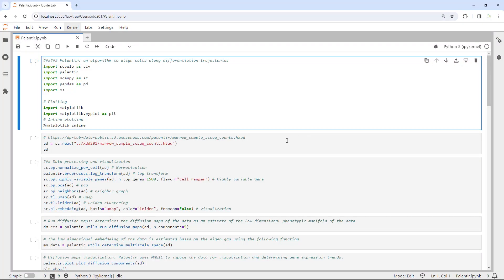Hello everyone. Welcome back to my video tutorial for single cell RNA sequencing data analysis. Today, I am going to show you how to use the Palantir package. It is a Python package to align cells along differentiation trajectories.